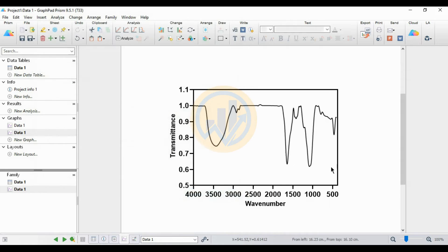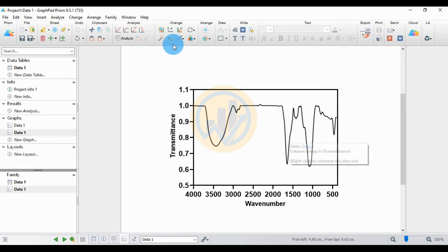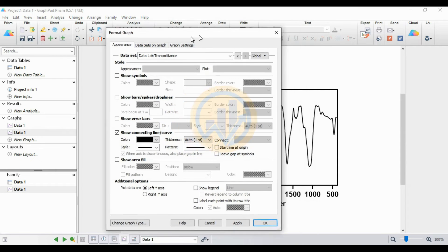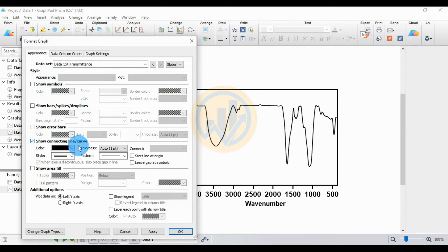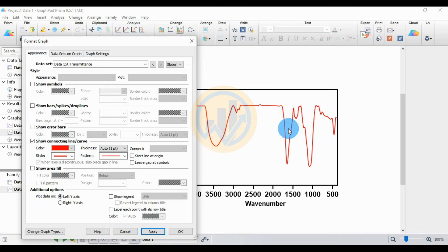Now change the color of the FTIR graph. Click the format graph option. In the dataset for transmittance, go to Style options: uncheck 'Show Symbols', uncheck 'Show Error Bars', and for the connecting line choose 'Line Curve'. The line color is currently black — change it to red, then click Apply.